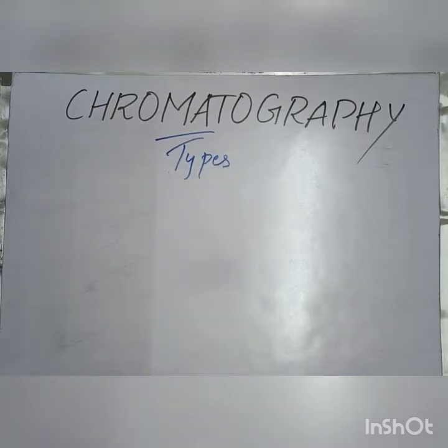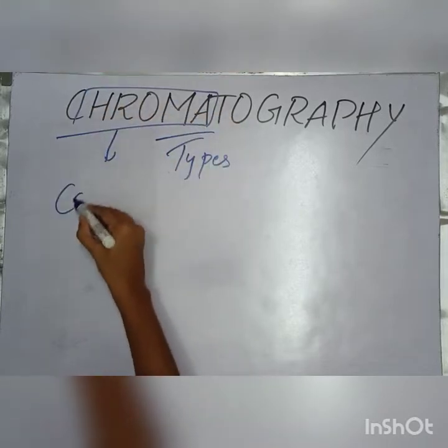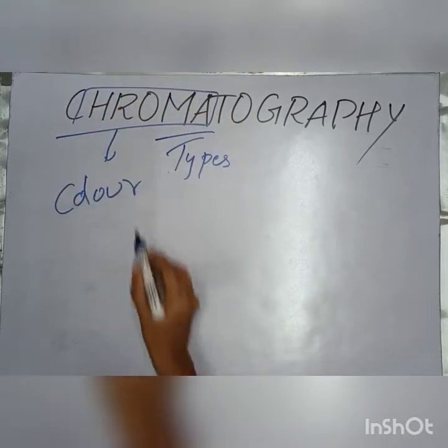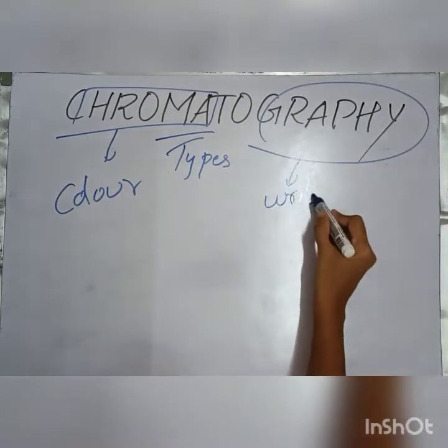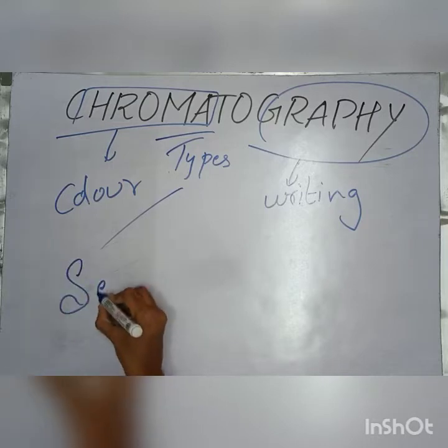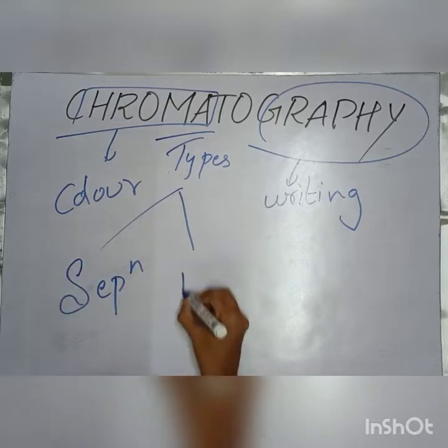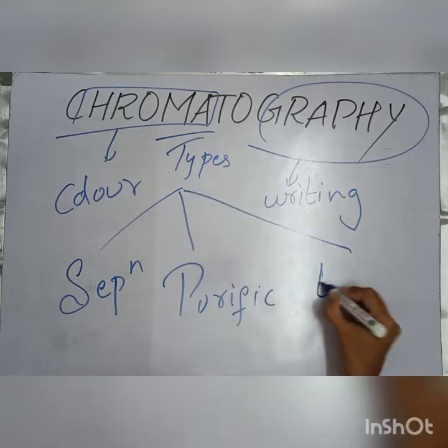So if you see the word chromatography, chroma means color, and graphy means writing. So if you see the meaning of the word chromatography, chroma means color and graphy means writing, which is nothing but color writing. So chromatography is useful for the separation, purification and testing.